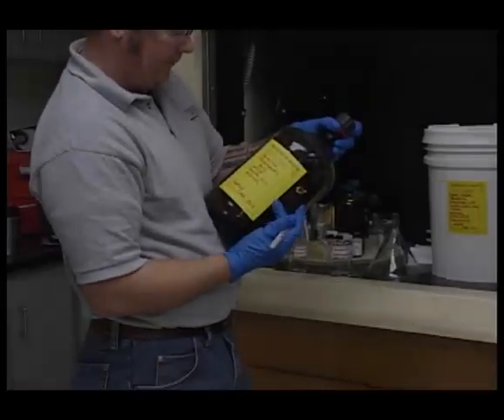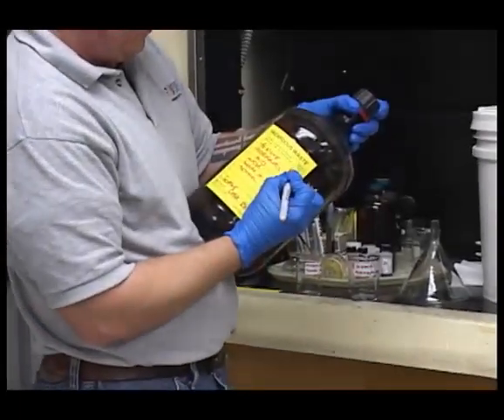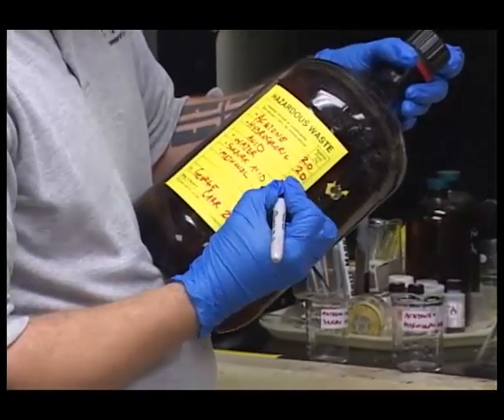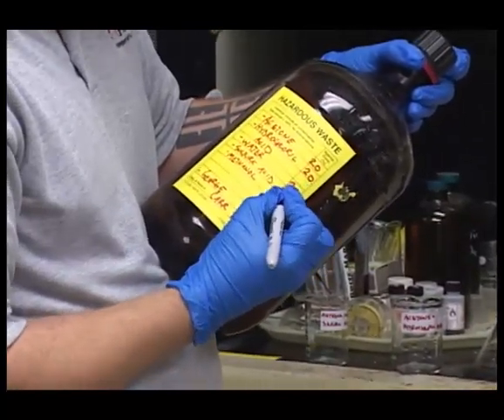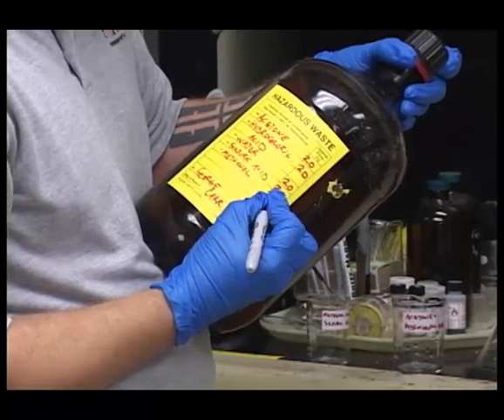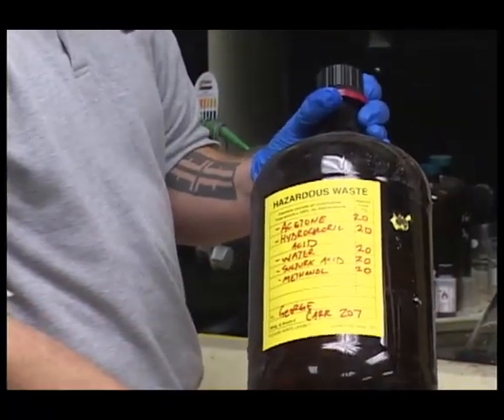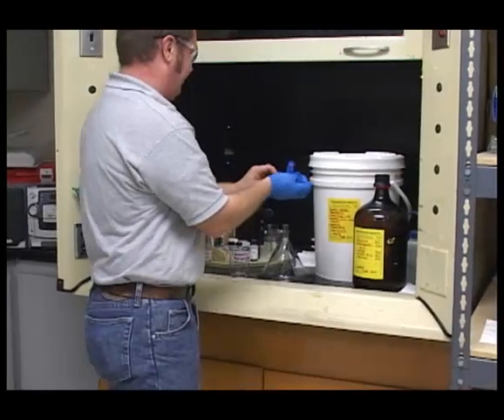Once the bottle is completely full, someone knowledgeable about the waste should go back and identify the approximate percentage for each of these constituents. While these approximations don't have to be precisely exact, we do ask that you estimate each of these percentages. The same thing can be done for your solid waste.